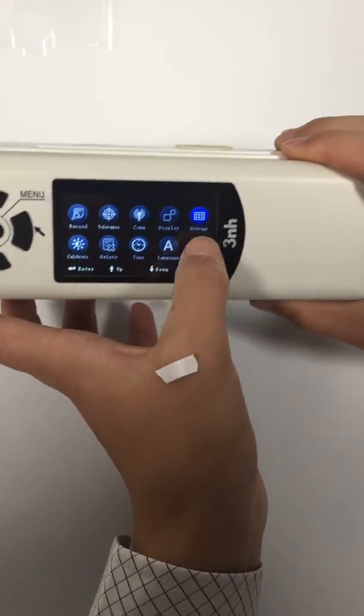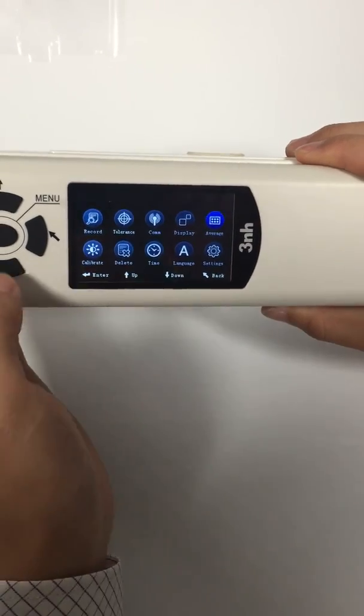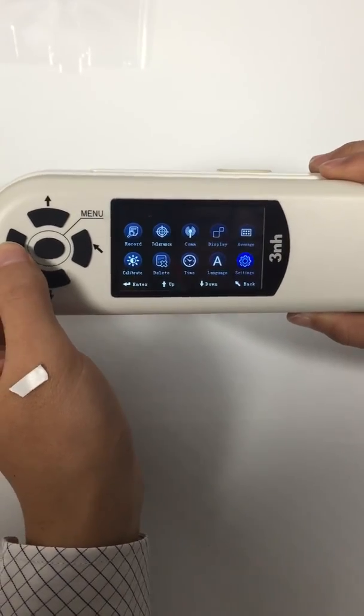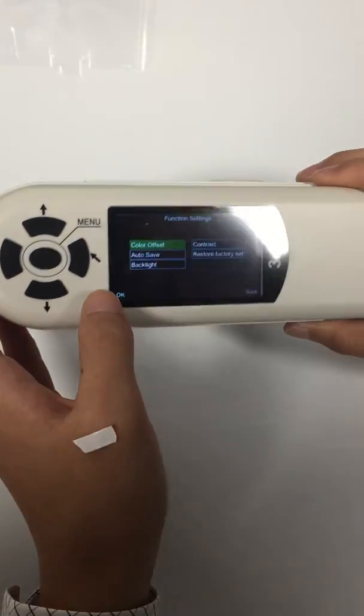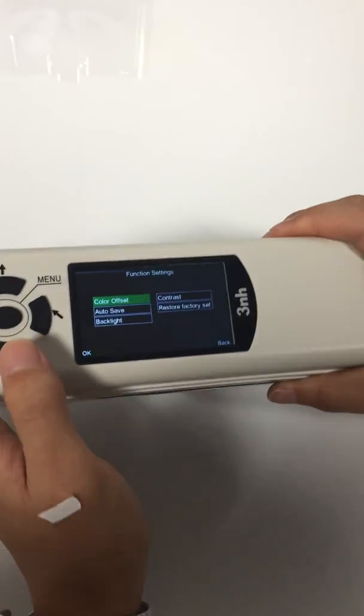Average to set average measurement. Settings for general system settings. Okay, that's all. Thank you for your attention.